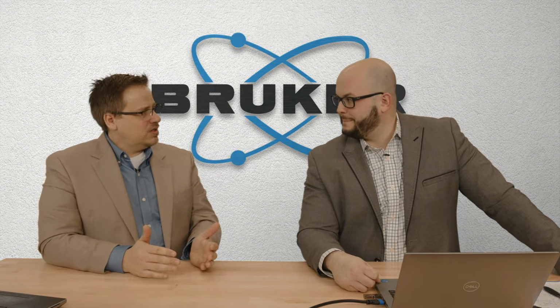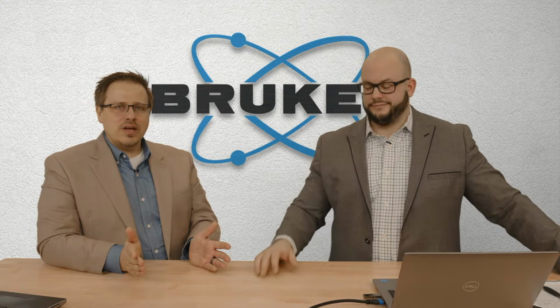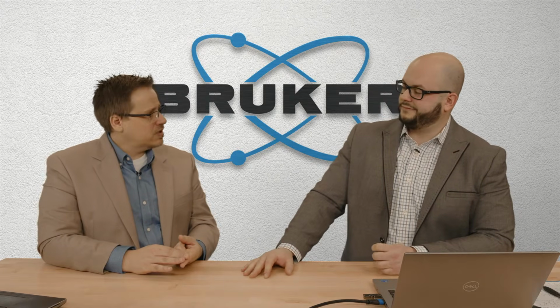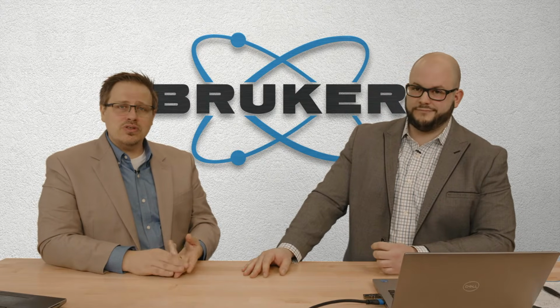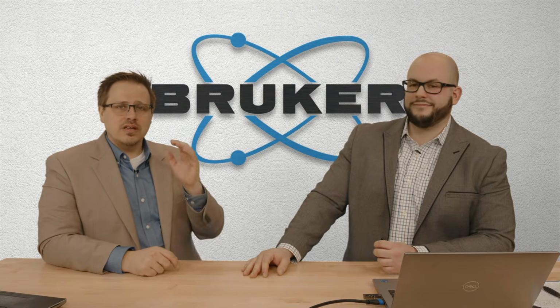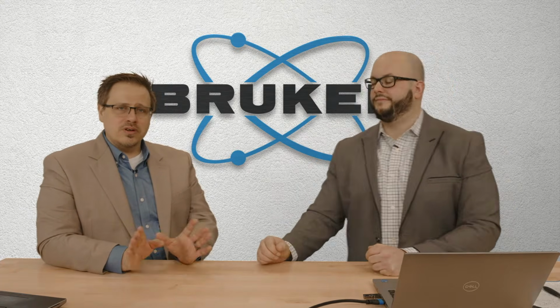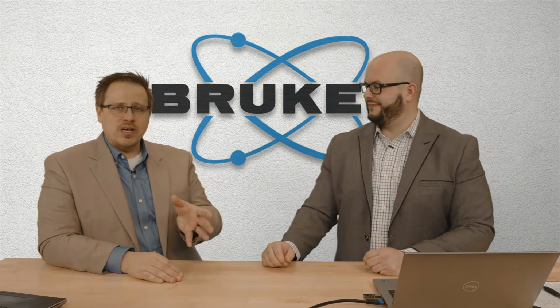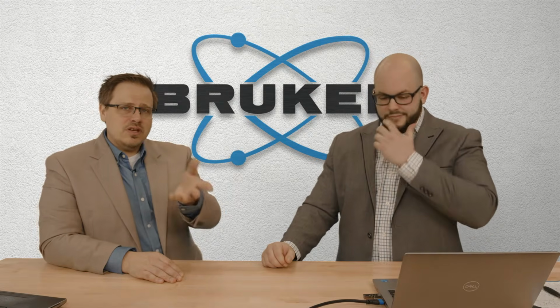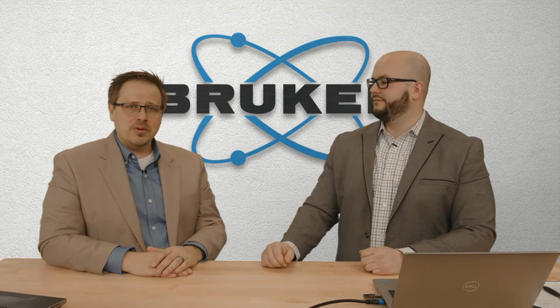Also, if anybody ever wants additional training on that stuff, we have a lot of training opportunities at Bruker. You have classes, so you can actually come to our facilities and take a class. We also do digital trainings, so you can schedule one of those and connect with one of our application scientists remotely. And we have video and all of that nice stuff so that we can help you out directly on your specific problem. Another option is that you can always schedule for somebody to come out and work on your machine with your specific problem on site.